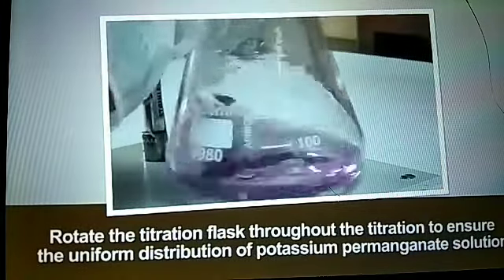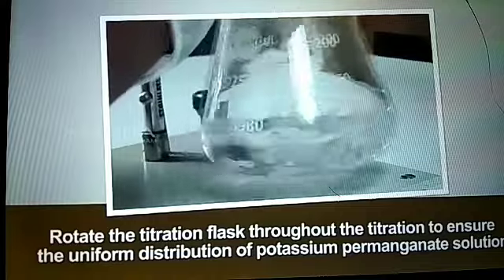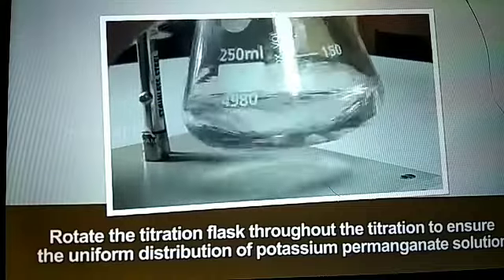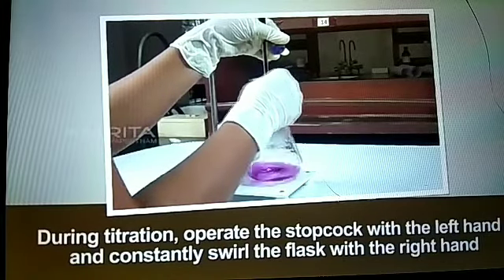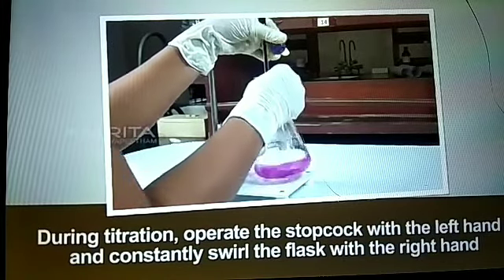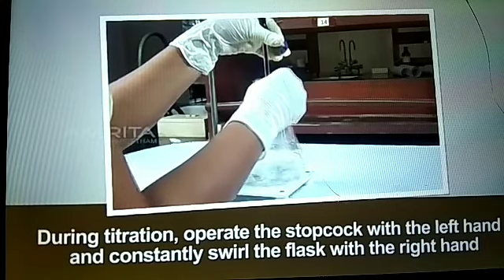Rotate the titration flask throughout the titration to ensure the uniform distribution of potassium permanganate solution. During titration, operate the stopcock with the left hand and constantly swirl the flask with the right hand.